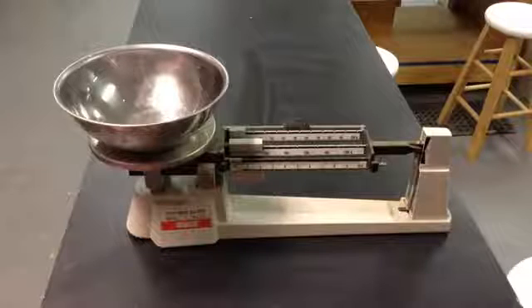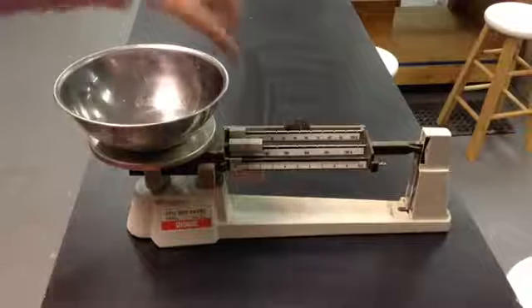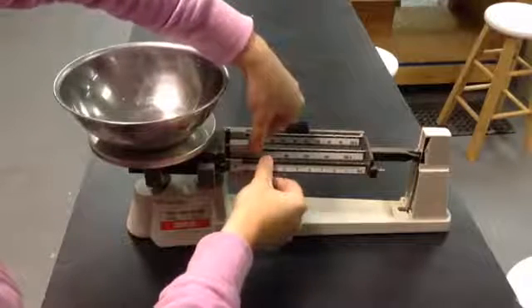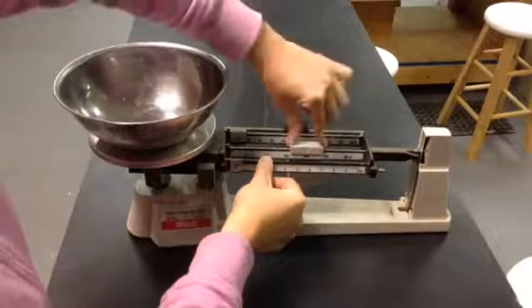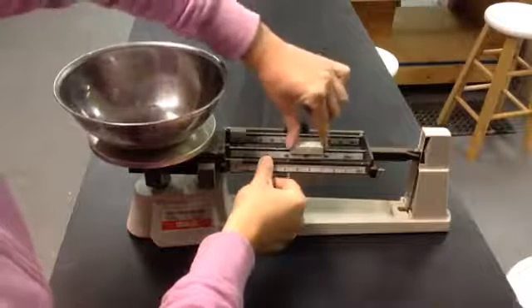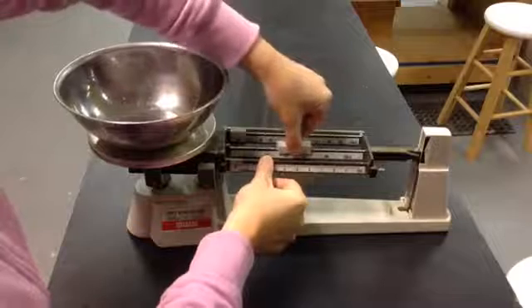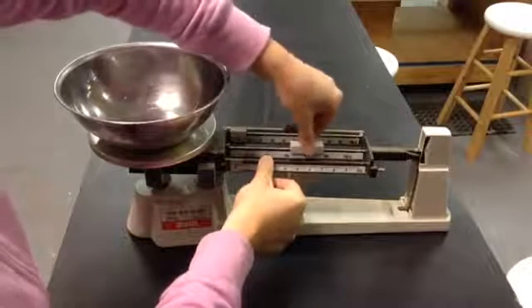Once you reach zero, you're ready to begin measuring your dry ingredients. I want to measure 342.2 grams. I will move my riders on the beams starting with the largest measurement, so I will move the largest rider on the largest beam to the 300, making sure it's firmly in the groove.